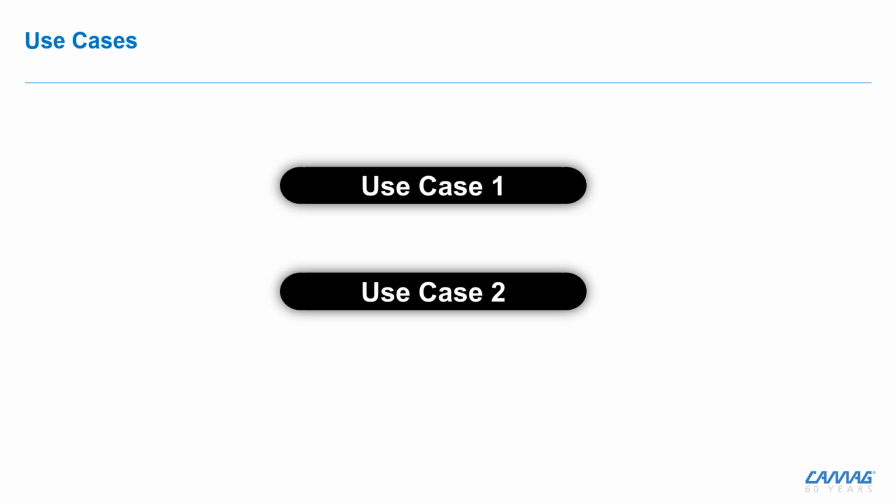We have also created two user guides, one for the peaks tool and one for the classification tool. In these guides, we have explained more about the different parameters and algorithms, which may answer many of the questions about using these tools.